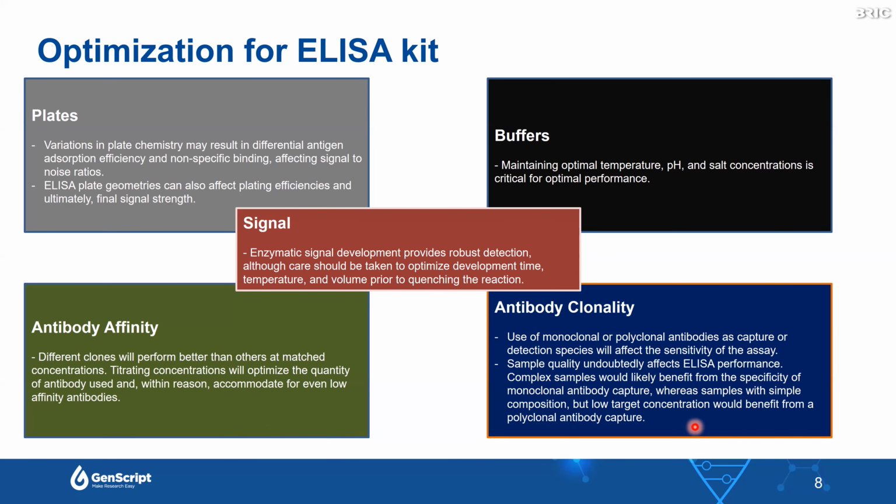Monoclonal antibodies offer specificity. They typically have a lower signal due to the limited epitope recognition. Polyclonal antibodies may recognize more epitopes of antigens, but with higher unwanted cross-reactivity potential. In sandwich ELISA, a monoclonal capture antibody will recover only specific targets from a sample. A polyclonal capture antibody will recover the maximal amount of the target, but with some non-specific binding.